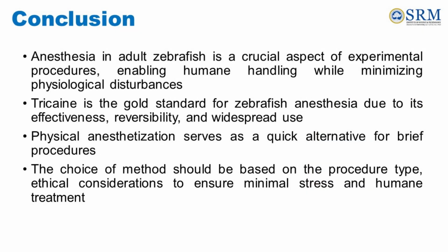In conclusion, anesthesia in adult zebrafish is a crucial aspect of experimental procedures enabling humane handling while minimizing physiological disturbances. Tricaine is the gold standard for zebrafish anesthesia due to its effectiveness, reversibility, and widespread use. Physical anesthetization serves as a quick alternative for brief procedures.